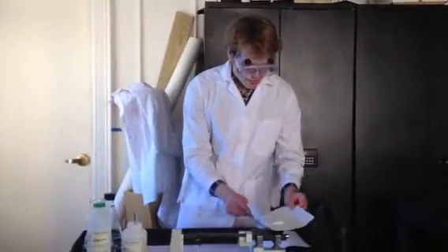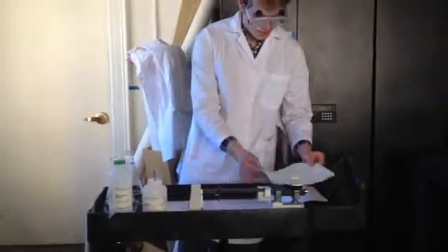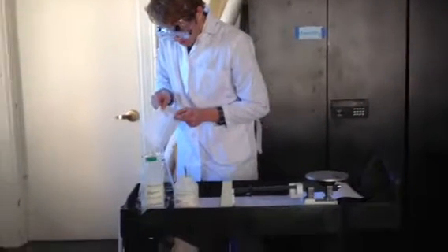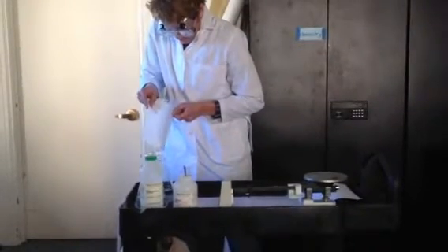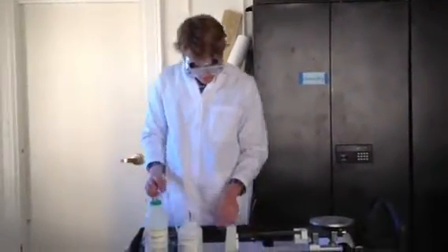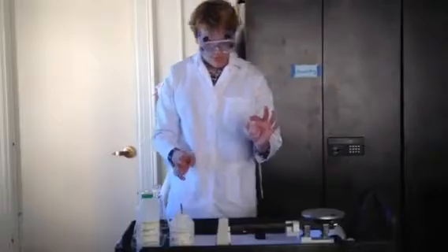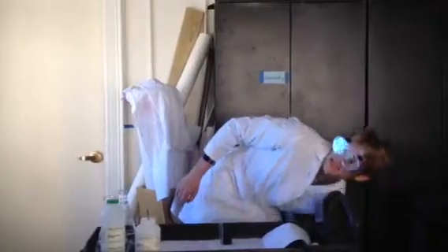But we're going to take this 5 grams of dextrose, and once I take the top off, I'm going to put it into flask B. Alright. Just pour that in there. Alright, and now we're going to add 2.5 milliliters of sodium hydroxide into flask A.